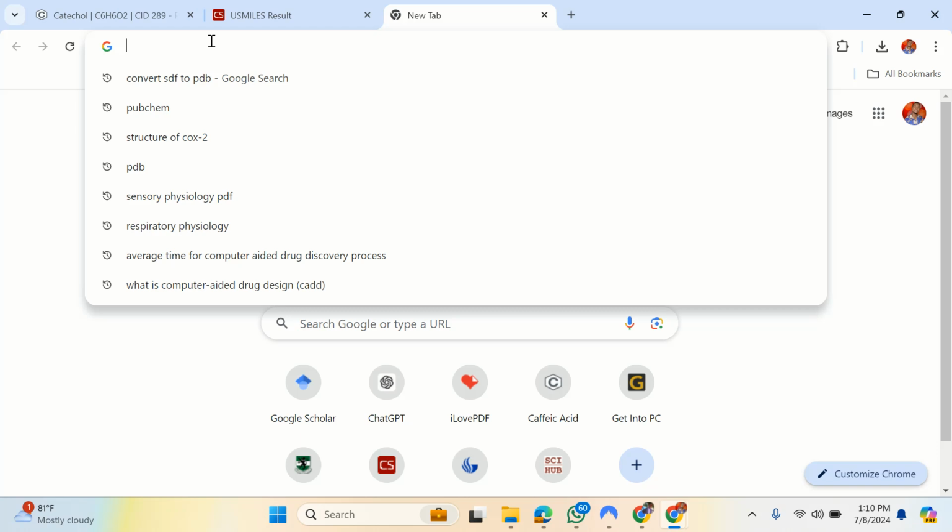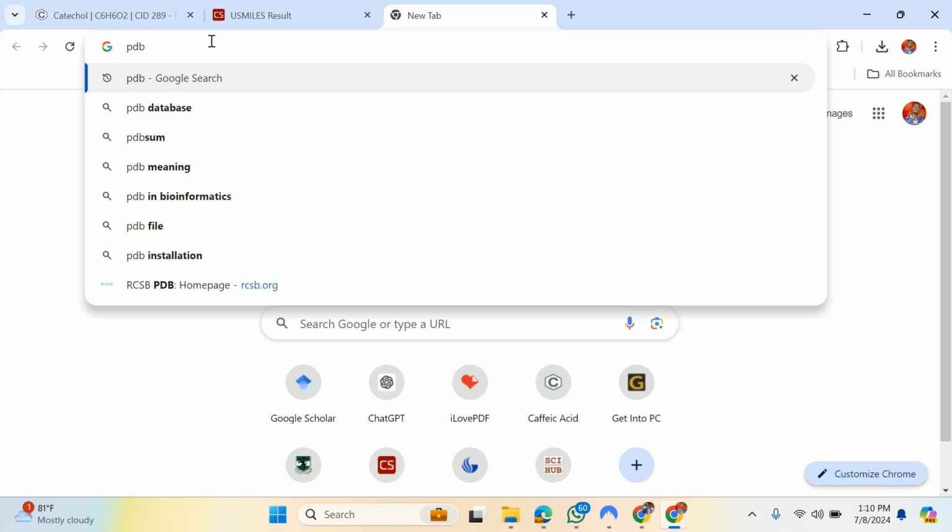Okay, usually it's some kind of designing or something like that. That's where you might see JSON and all that. Is that okay? So go to our PDB to get our what?